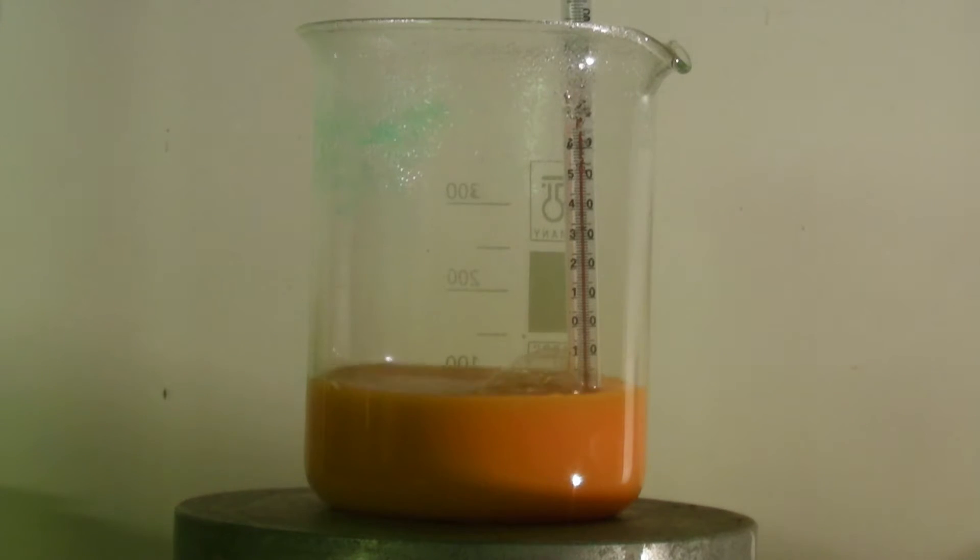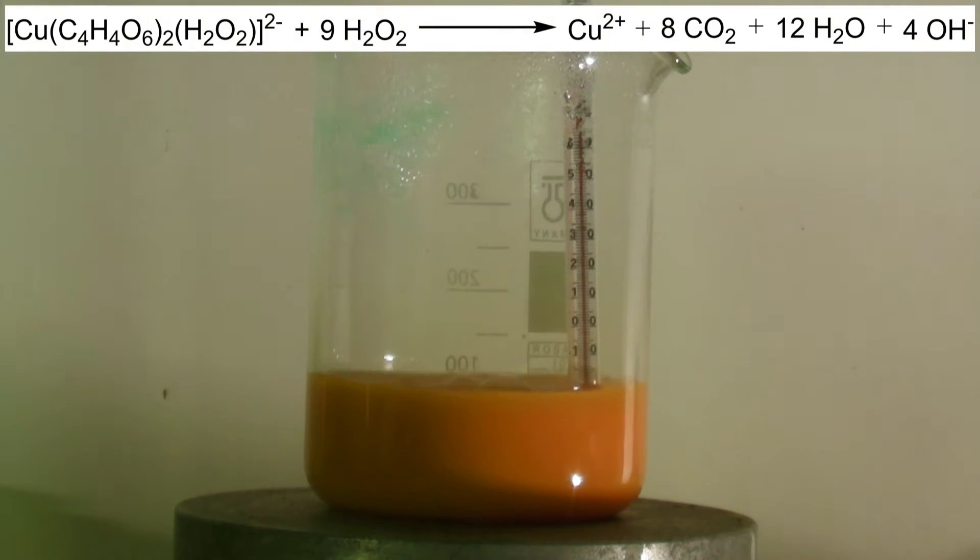The copper sulfate has formed a complex with the tartrate ions and the hydrogen peroxide which catalyzes the oxidation of the tartrate into CO2. The heat of the reaction causes the reaction rate to increase significantly.